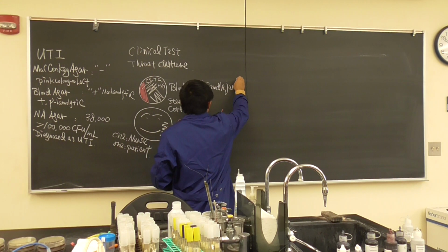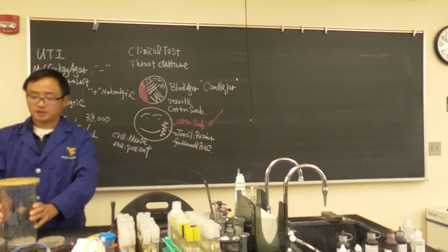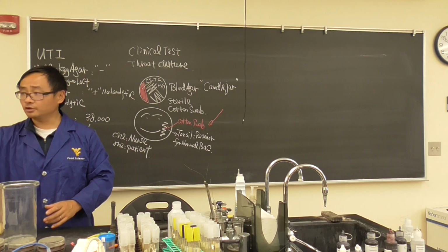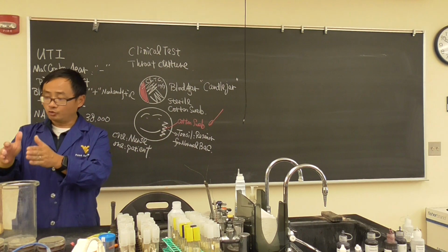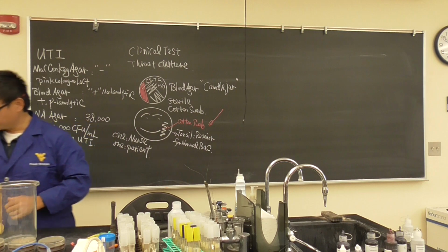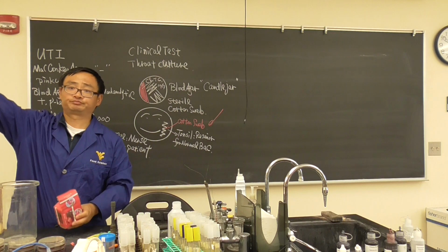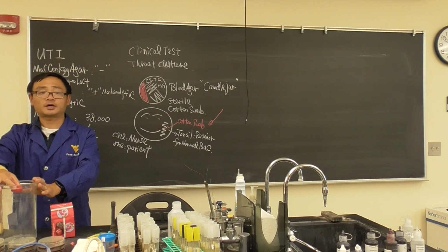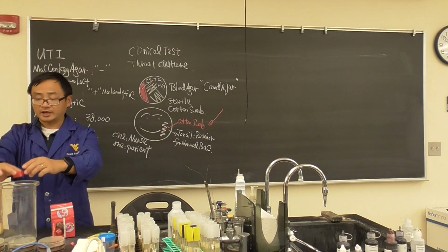And these blood agar plates, we will use a candle jar to do the incubation. What is a candle jar? This is a jar. And we need to put a candle. So how do we do it? When you finish all these, your blood agar will move to here. Okay, once you move it here, what are you going to do? I have this from Yankee Candle. So I'm going to put the top. Does anybody have a lighter or fire? We have one on the top. Oh yes, good. So we're going to light it, and then we're going to cover it.